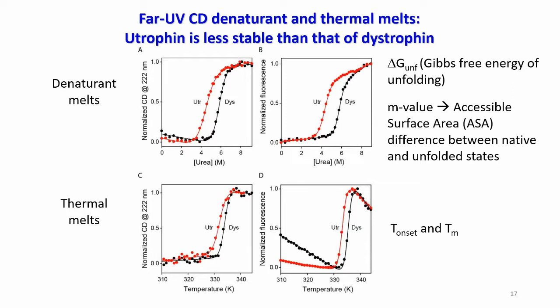Thank you, Dr. Mallela. We have time for one more question. A viewer writes in, did you try to calculate KD values from the CD data by titrating the substrate? If so, how does it compare to the ITC results?